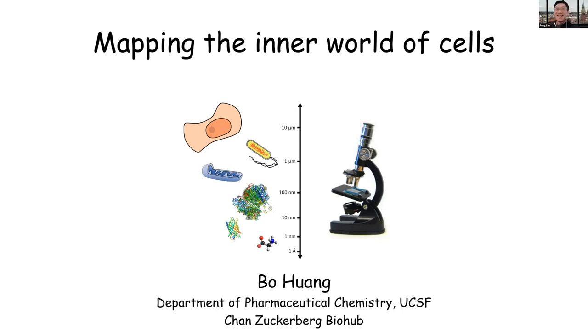But so far it's really limited. The only thing I can think of is photoactivatable fluorescent proteins that you can image and bleach, and then activate a second protein in the same color channel. But the issue for live imaging is that we need to care about temporal resolution, and we need something that can be repetitively switched. That's the difficulty.